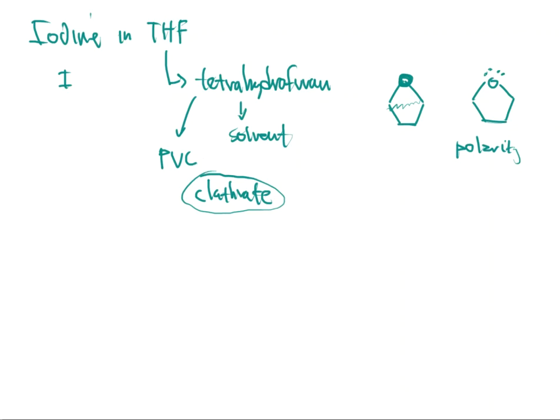All right? The LD50 for tetrahydrofuran. LD50 means the lethal dose that will kill 50% of the population. It's very similar to acetone. So this is going to take quite a bit in order to kill you. But it is a possible carcinogen. So I don't want to be putting my hands in it. I don't want to be bathing in it. I don't want to be rubbing it on my skin. I don't want to be breathing a lot of it in, even though the LD50 is very, very high and the exposure limit is enormous for this molecule. It is associated with cancer. So I want to limit my exposure whenever possible.